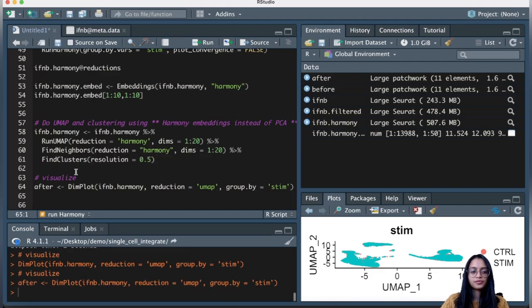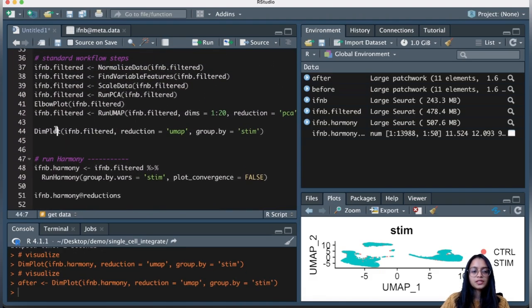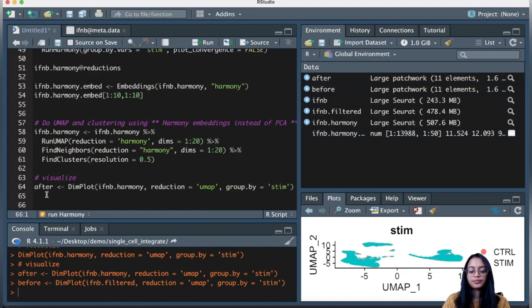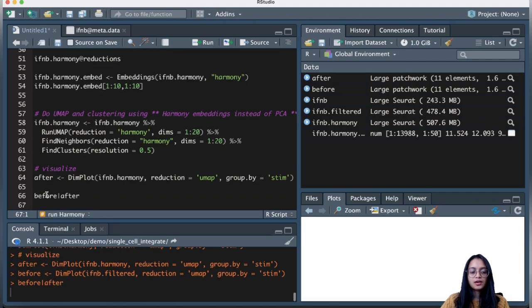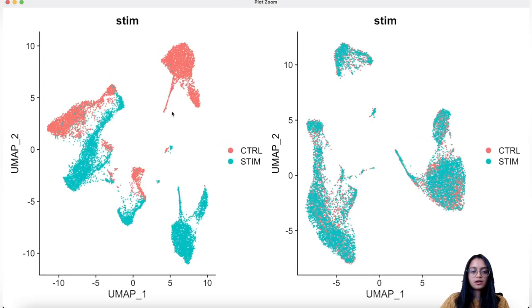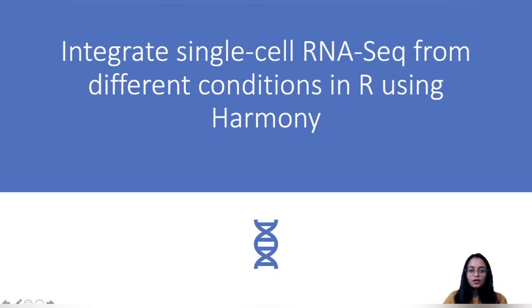Let's create a before-and-after plot. I'll save the current result as the 'after' variable and scroll up to save the previous dimension plot from the filtered object as 'before'. Visualizing them side by side: on the left, cells separated by condition before integration; on the right, cells that are similar in both conditions overlaid over each other after Harmony integration.